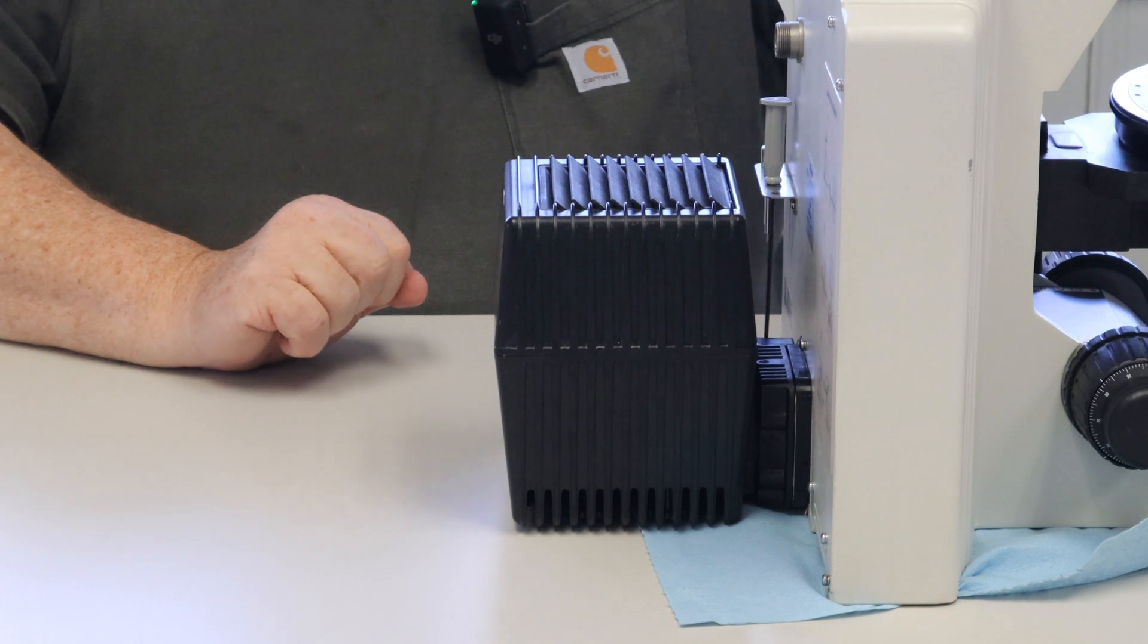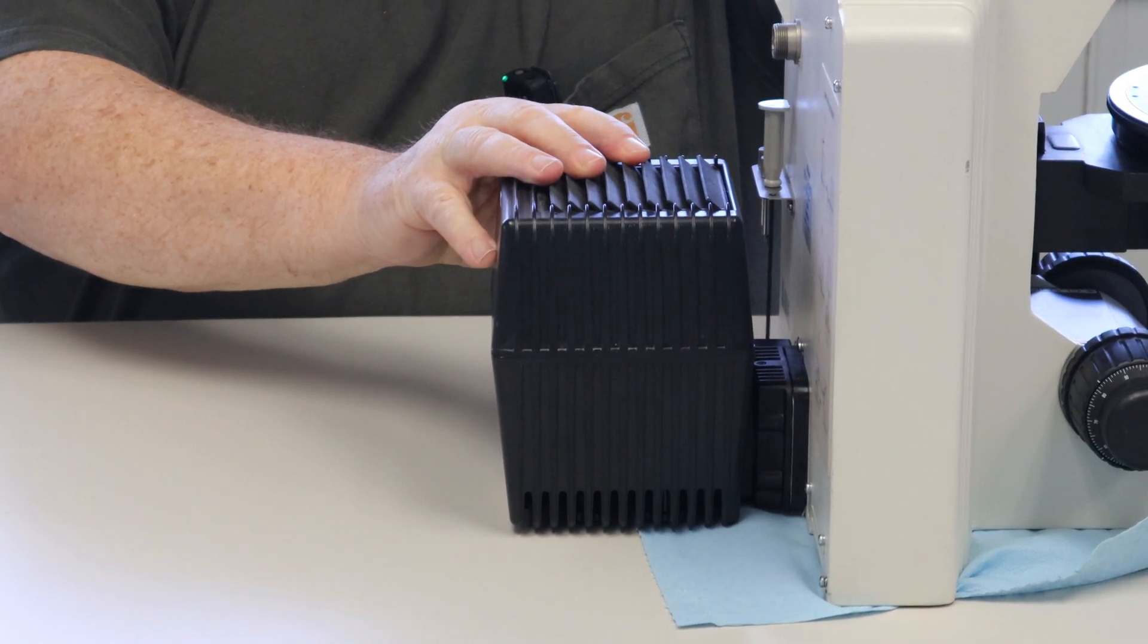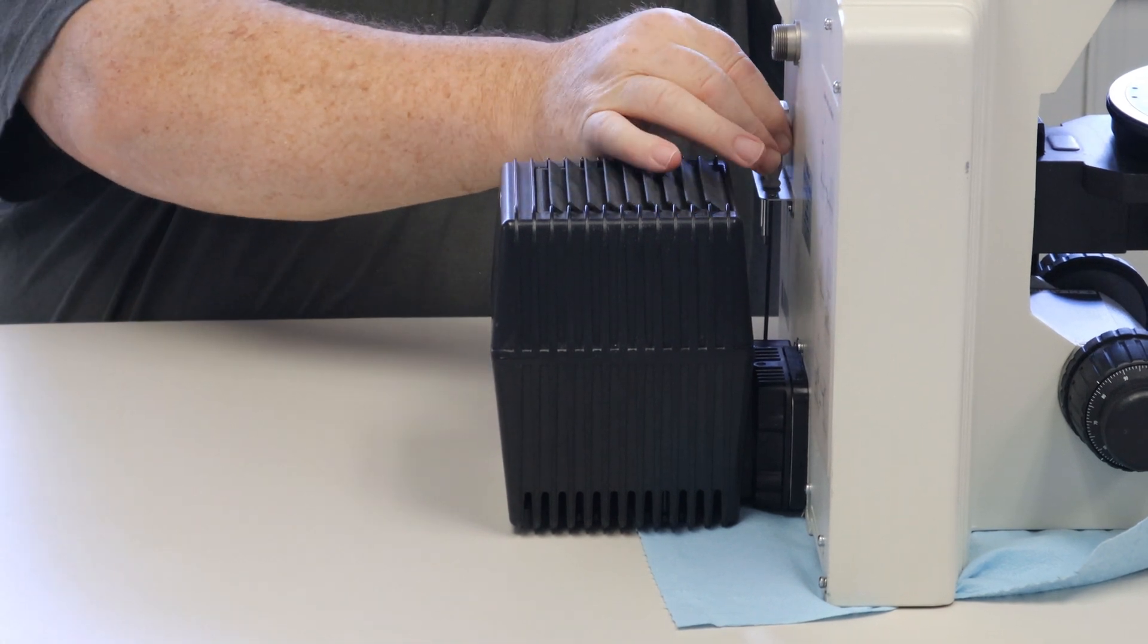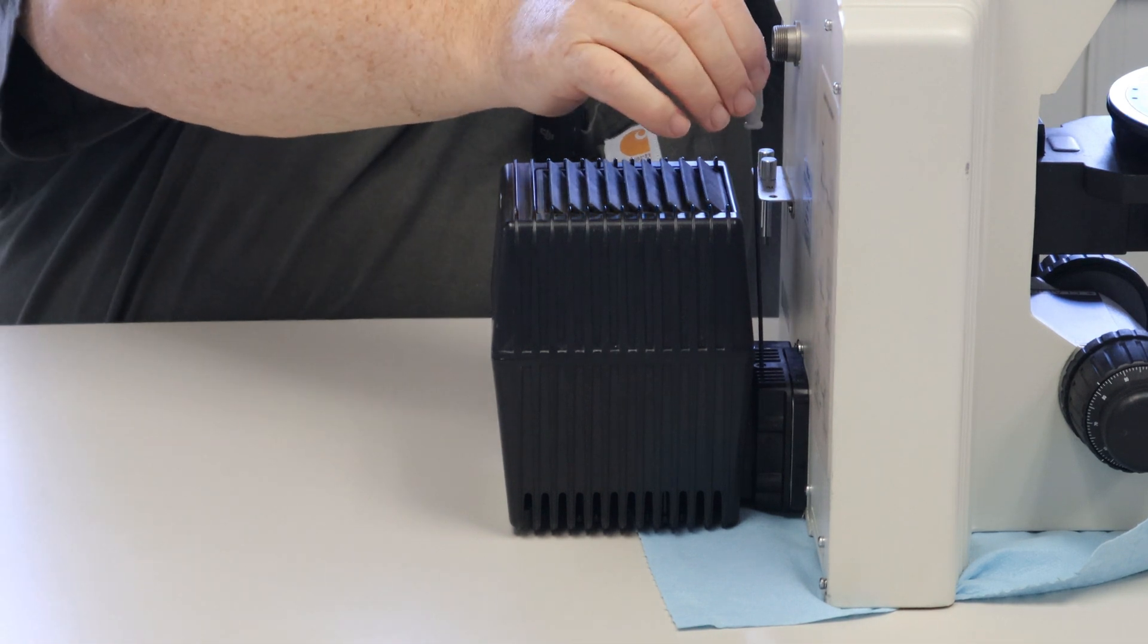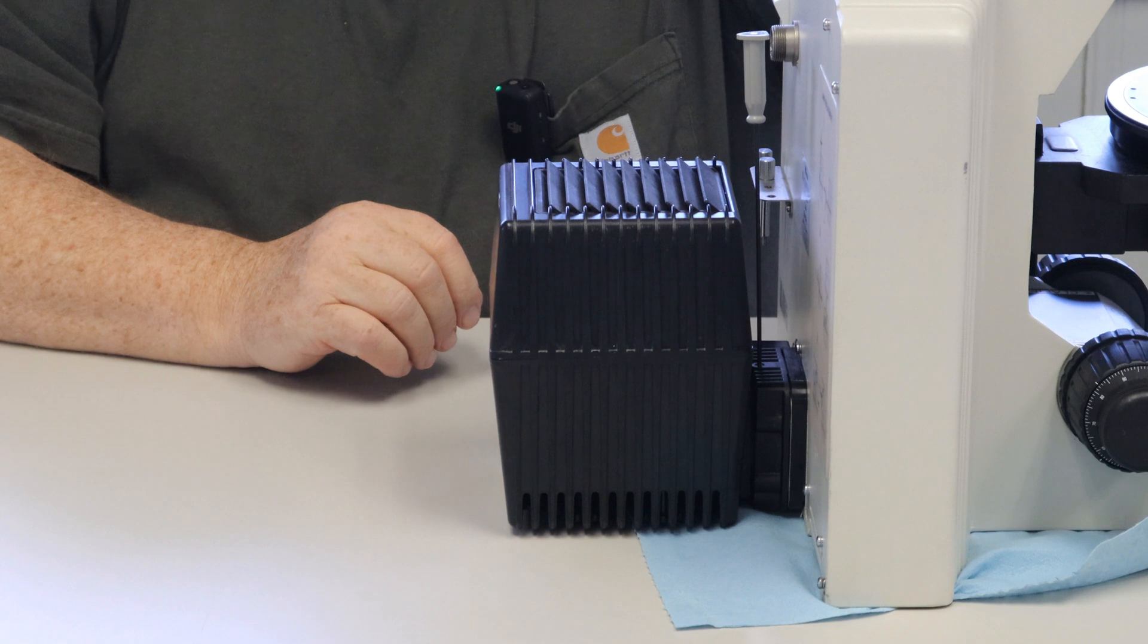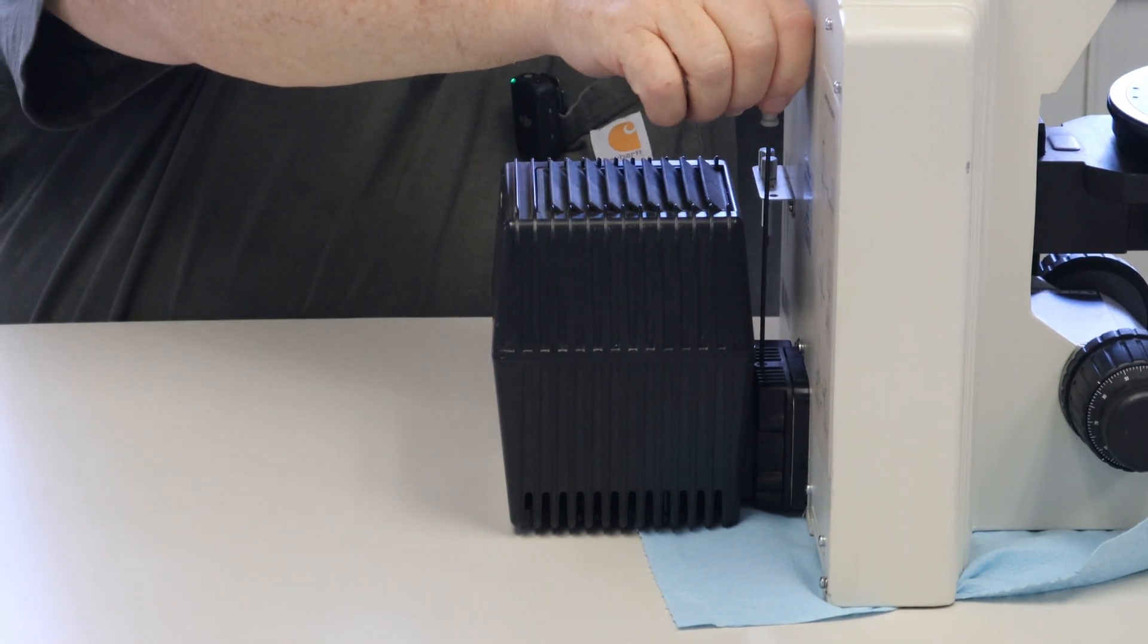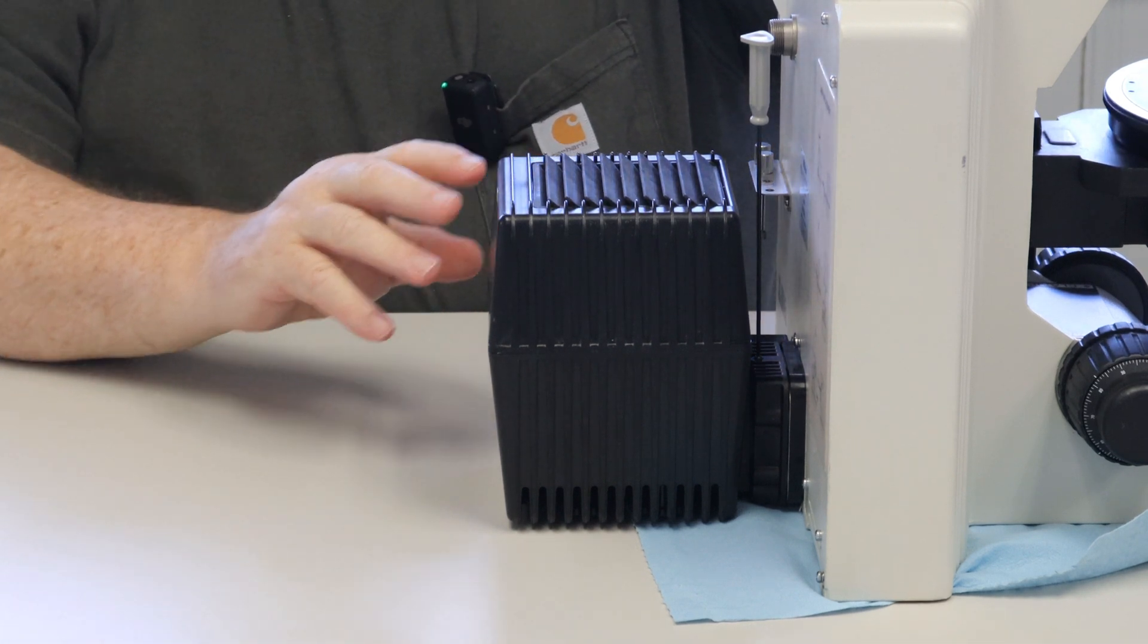To change the bulb in this lamp housing, you have a handy wrench. Nikon gives you one with every scope. It goes right into the screw right here in the middle of the lamp housing. You can simply turn that and pull off the lamp housing.